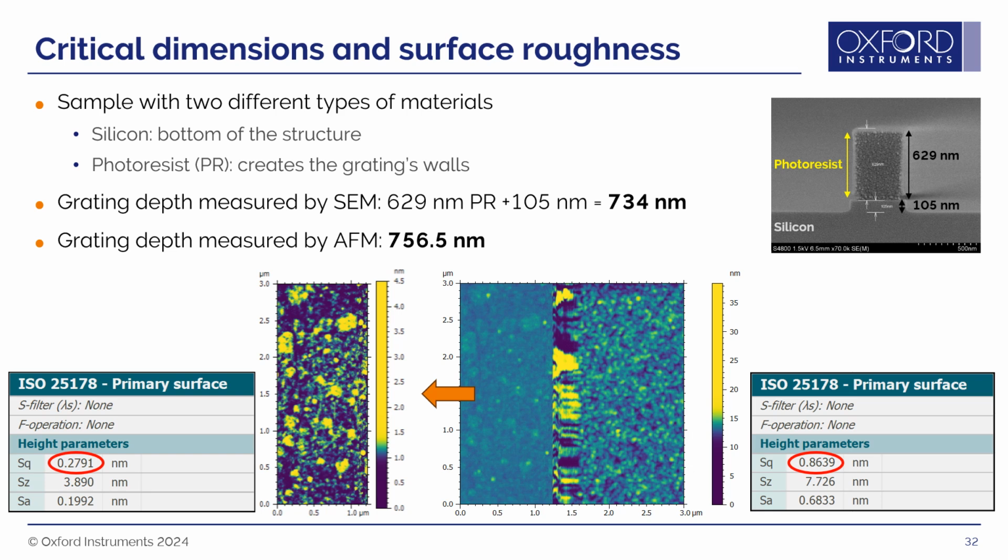As you can imagine, obtaining trench sidewall roughness is more complicated due to sample geometry. If you would like to learn more about sidewall roughness measurements, please tune in to our next webinar, which will be on June 12th.